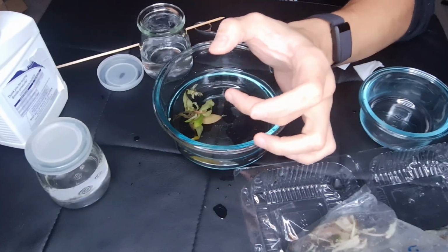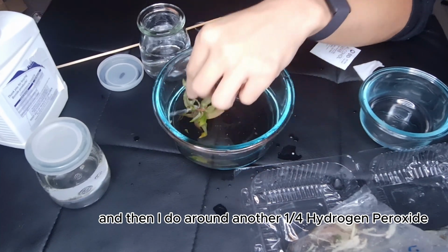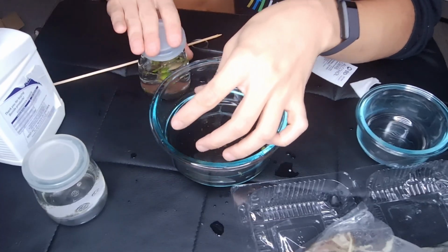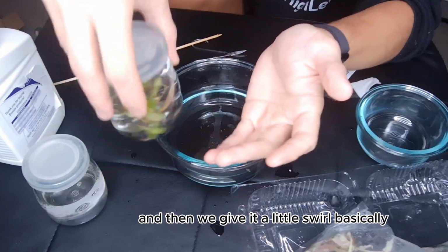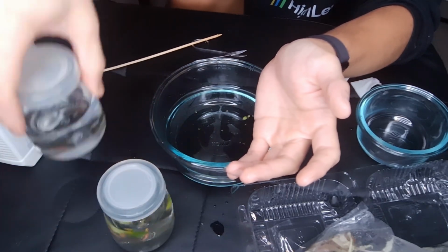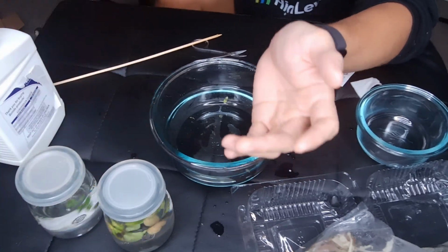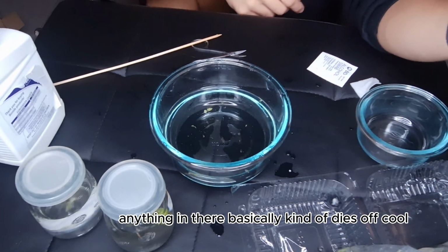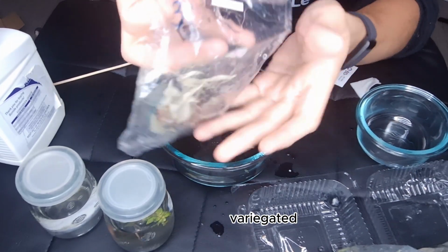Water, which in this case is around 50 mils, and then I do around another 1/4 of this hydrogen peroxide, and then I just drop in there the tissue culture plant, tighten it, and then we give it a little swirl, basically. Then we have the other one, which is bubbling a little bit, which I like, and then I just keep swirling it around. That's going to help make sure that anything in there basically kind of dies off. Cool. Alright, so the next one is going to be the Alocasia Bambino Variegated.